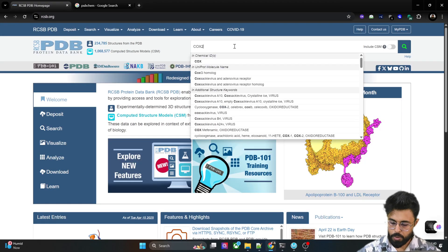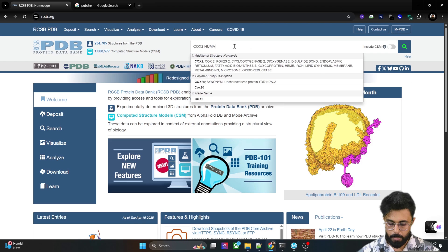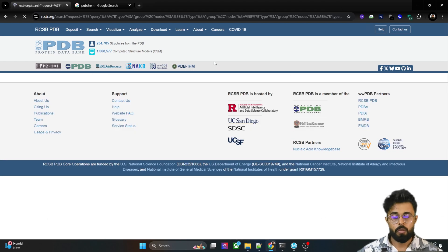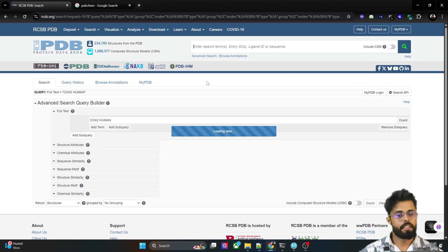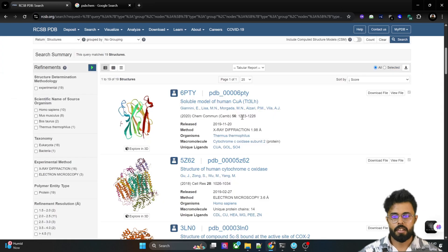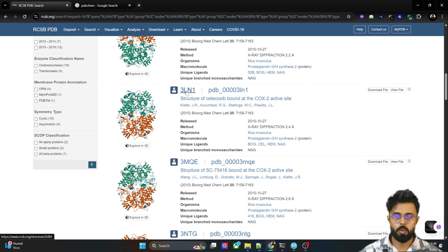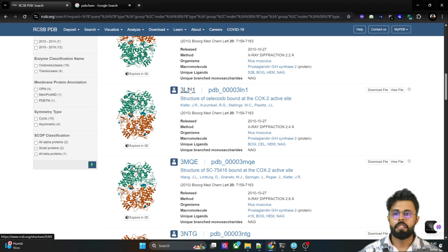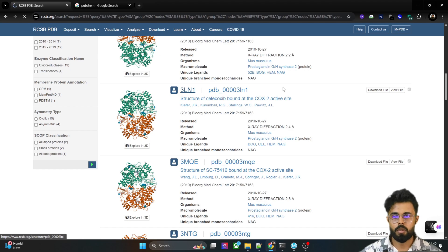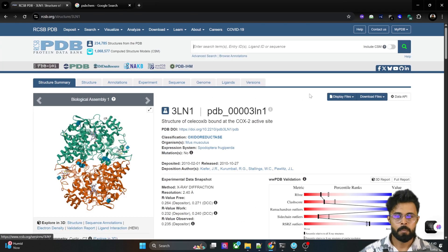We can type here 'COX2 human' and we will get different protein structures. We can choose this one — 3LN1 — which is the structure of COX2 where a particular ligand, celecoxib, is bound. We can download the structure.